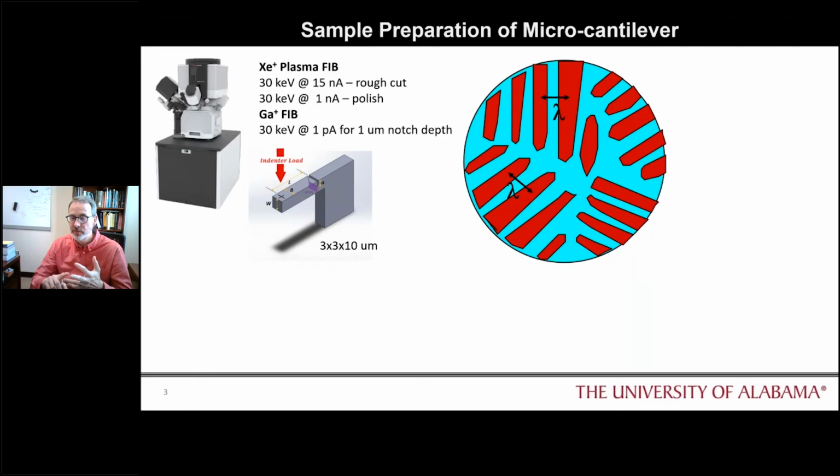So with that information, one of the things you can definitely see is that when you take an SEM image versus a video capture, you get very, very nice images. But what we have here is a set of our 1095 steel in which the laths are perpendicular to our beam direction and our notch here. And this is before the test, after the test when it ended, and we did 2 samples of each, and here's the other end of the other test as well.